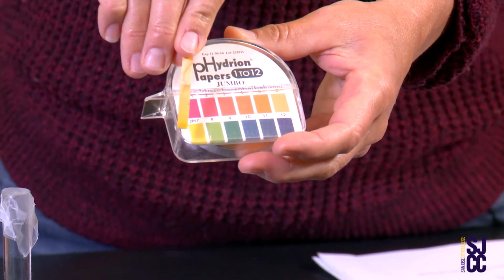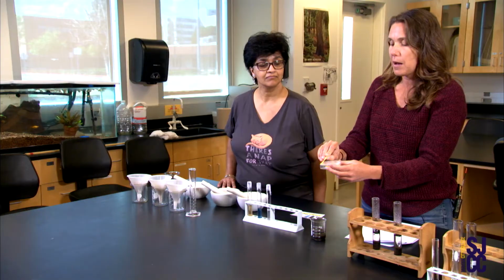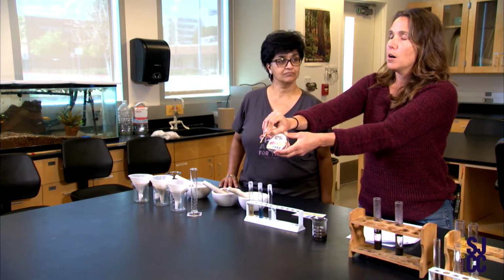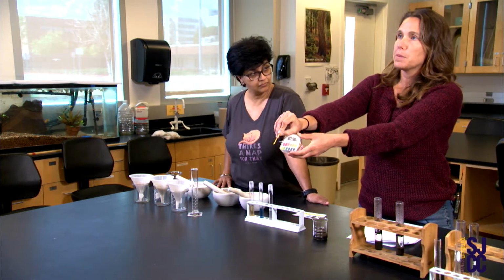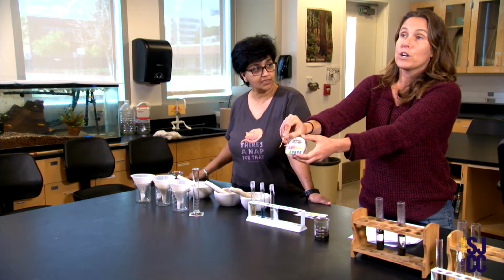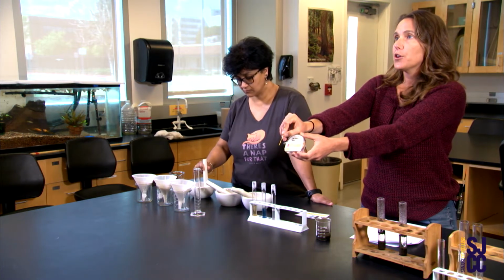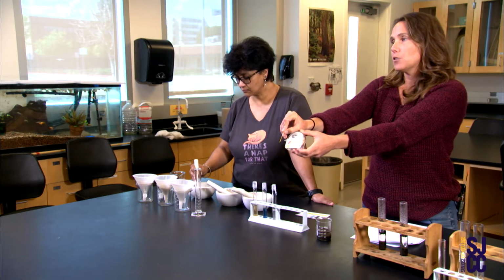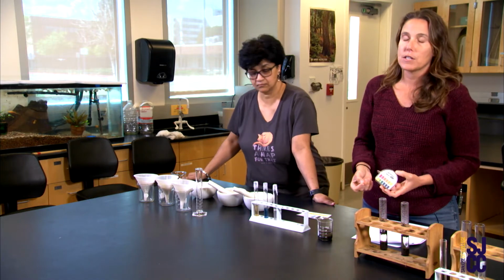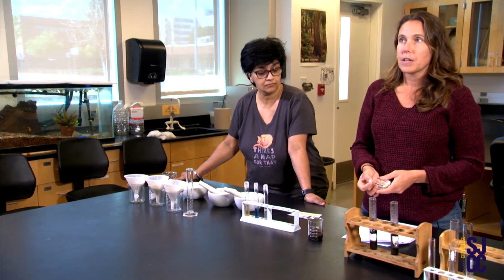Typically the pH of your soil with the water should be around 6 to 7. Ours is about 7. All right, so that's a good pH. A lot of plants do well with a pH of 7, but some plants like blueberries like more acidic, right? So they have a lower pH on the spectrum, where other plants like a higher pH, or more alkaline or more basic. So it's really important to understand the pH of your soil to know what type of crops you should grow.